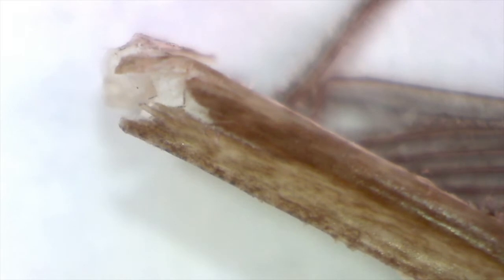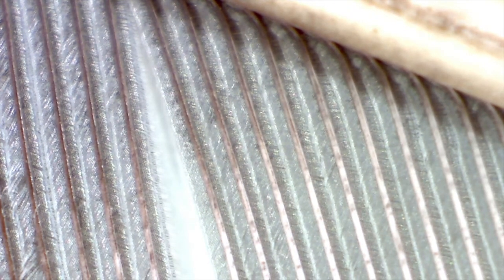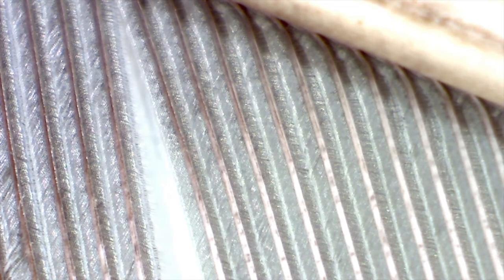We're looking at the base of the feather. This is the bit where it would have attached to the bird. It's a sort of hollow shaft called the calamus, and that goes on up through the feather. This is the main shaft of the feather, you can see there. And coming off the central shaft are these little barbs, and they themselves have got structures on them called barbules and hooklets, which are what actually keep those barbs together and form the surface of the feather and help the bird fly.